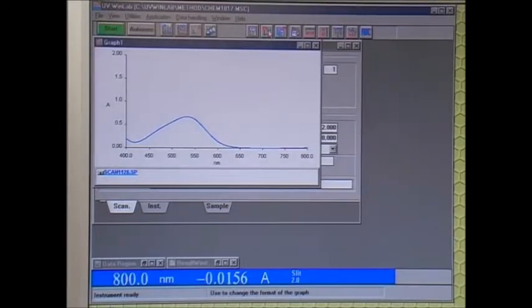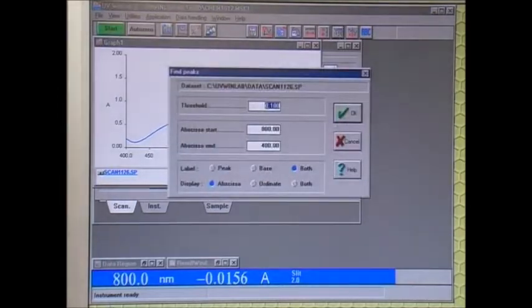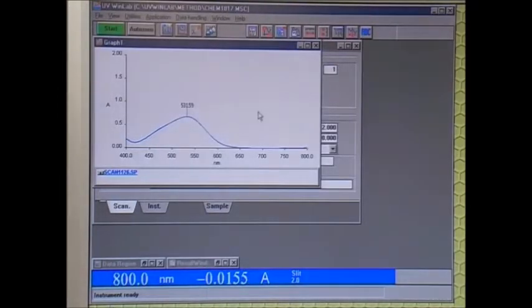Once the data acquisition is finished, add labels using the program, like the height of the peak and the substance name.